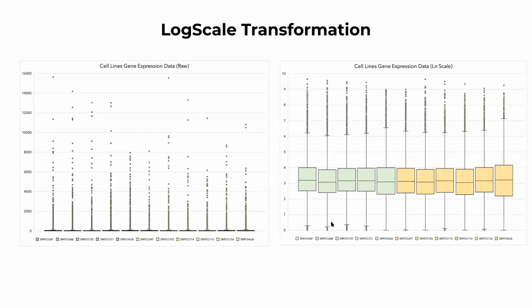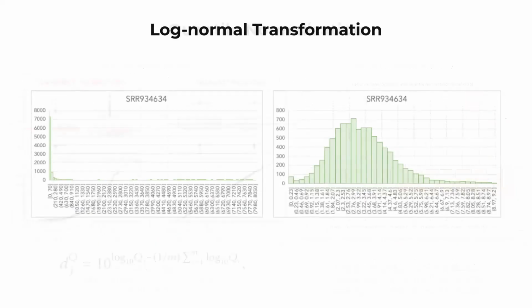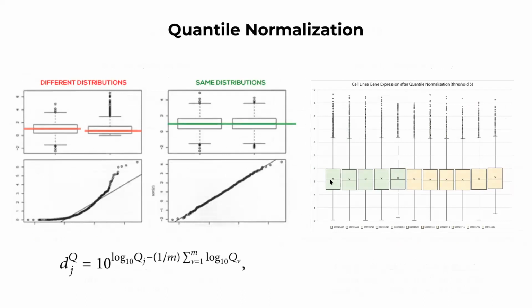Some of them, for example, have outliers here. Others don't have outliers. After log normal transformation, we do see a lot more information, but now look inside each condition, there's a lot more consistency in the mean and a lot less variation in the outliers. That doesn't mean that the variation does not exist, but they are much more comparable.